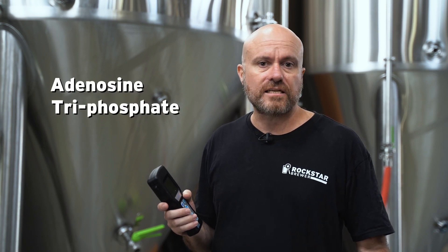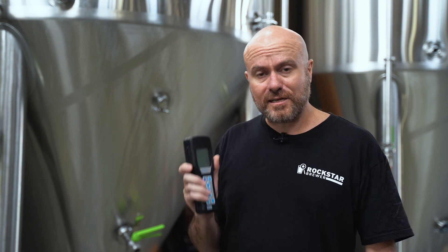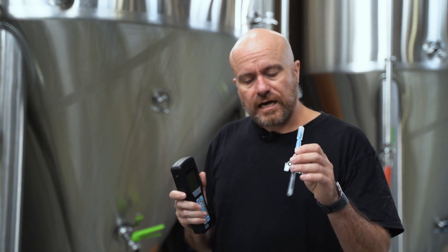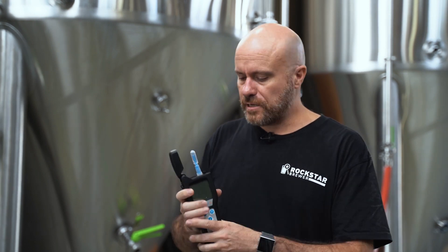The ATP meter is a way for a brewer to very quickly check that the tank is clean every time they run a CIP and a SANI of a tank. Every living thing has a molecule in it called ATP, which stands for adenosine triphosphate. It's basically the life force that exists in us as human beings, animals, plants, and even microorganisms like yeast and bacteria.